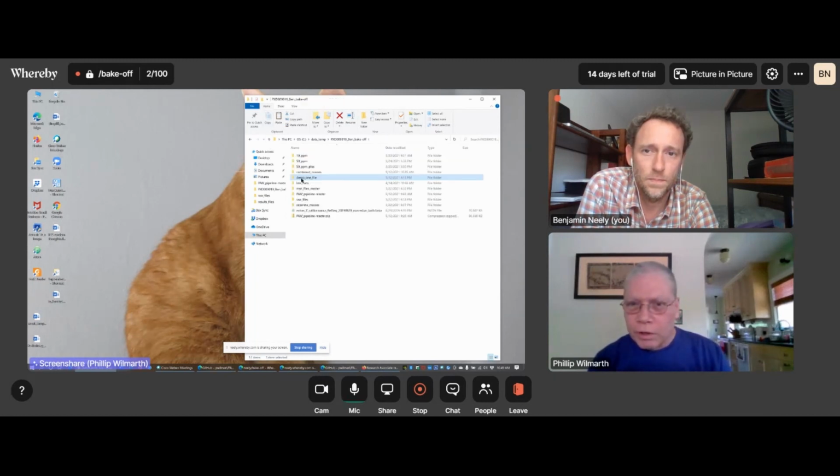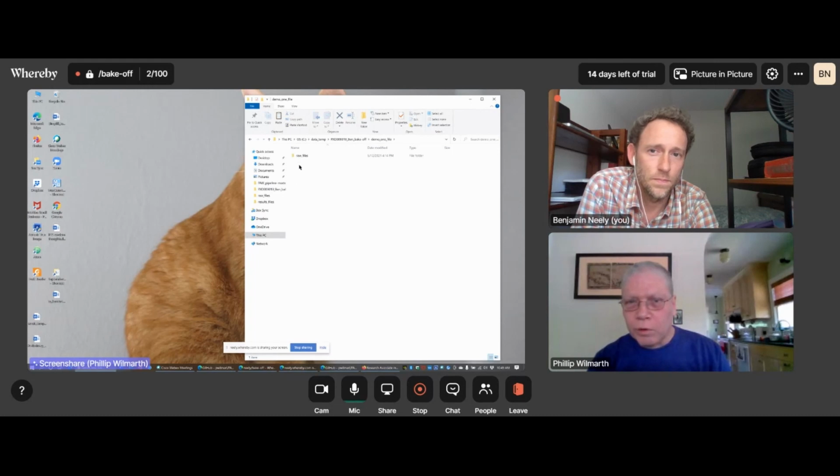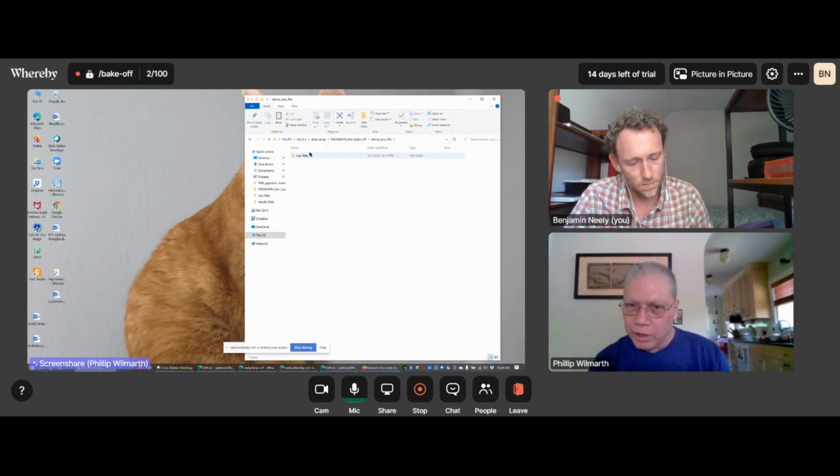And normally on project organizations, you make a folder called raw files and you put the raw instrument files in that. And that's the starting point for where the scripts are going to go. And it'll produce additional files and new folders, but all in the same folder where your project lives.